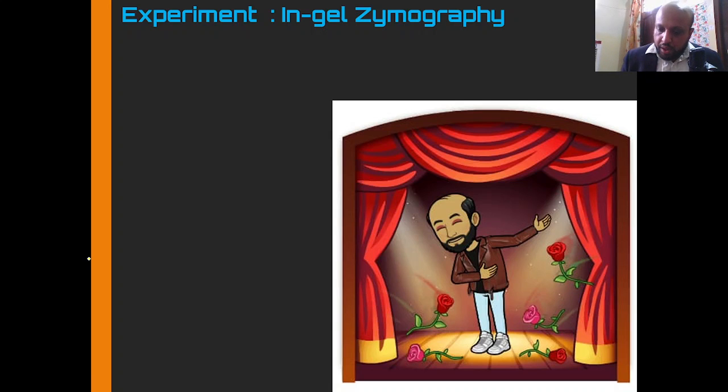So welcome back, and I will be talking about in-gel zymography. Now there are two terminologies here. One is called in-gel, and one is called zymo, and graphy. Like three means zymography, maybe one word. So in-gel suggests that it is within a gel which is working. The zymography is a kind of a graph which you are getting for zymogens.